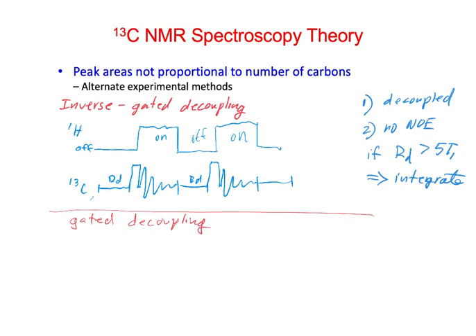Okay, and this is just kind of the opposite of that one up there. So we have the C13 channel, which is the same, like this. And the proton channel is just the opposite.